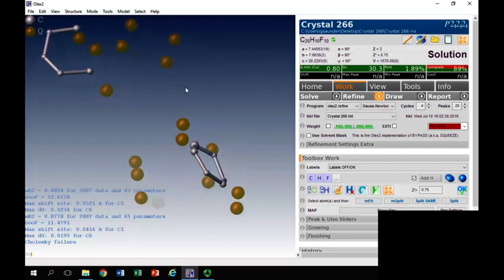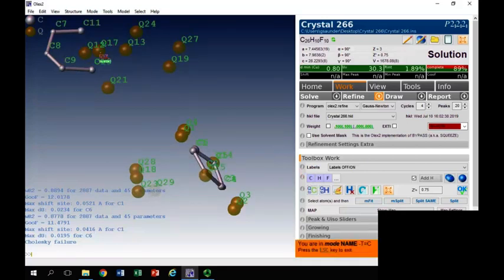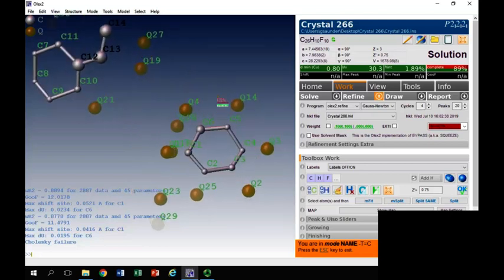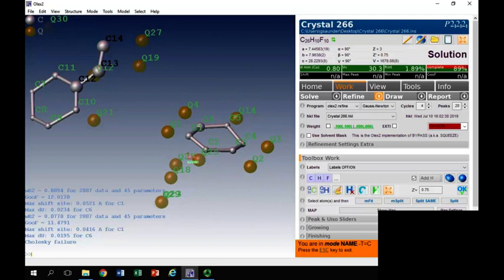So you can see now that when I click the Q again, it put a carbon atom in this position. So we can put a carbon atom there. It looks like there might be something bonded to it here. Let's put that as a carbon, and one there. We've also got 6 things around the hexagon.